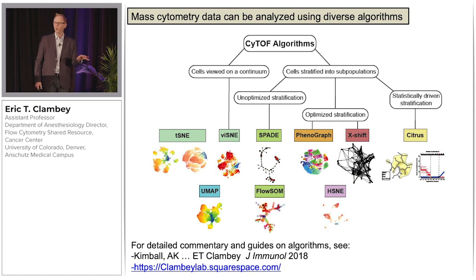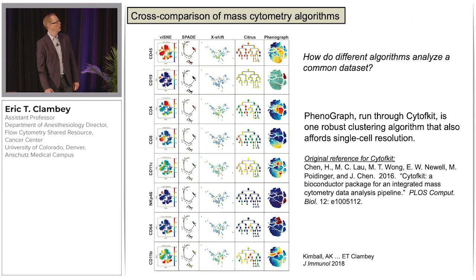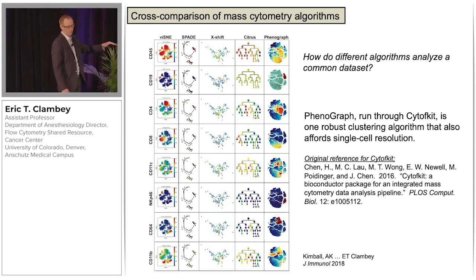So in our paper, we provided detailed commentary and notes on five of these algorithms. And since then, we've provided additional details on our lab website, and I'd encourage you to check that out. Okay, so we've also cross-compared CyTOF analysis algorithms. Here we compared five different algorithms across different columns, and then analyzed marker expression in different rows.